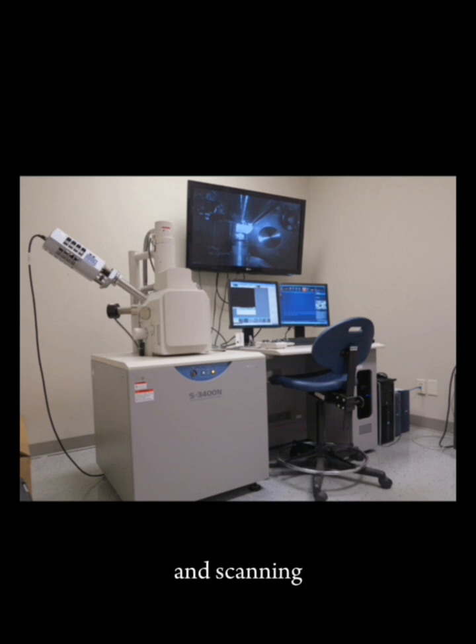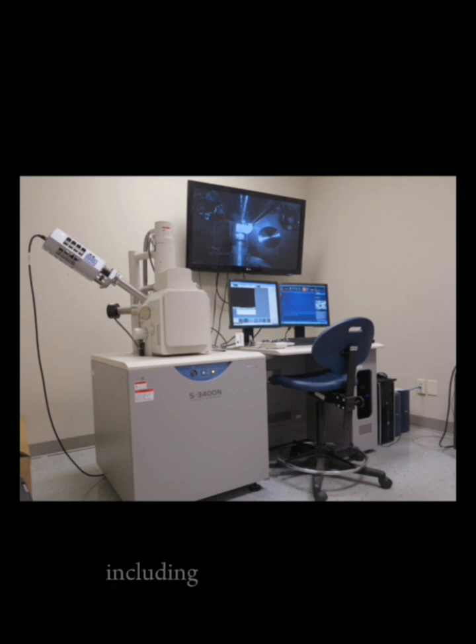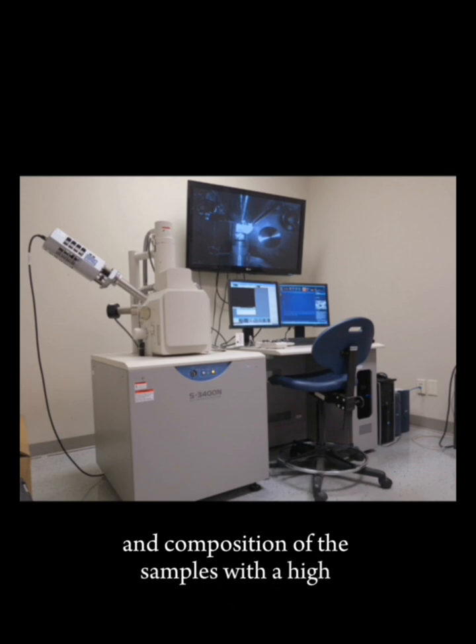Scanning electron microscope is a type of electron microscope that produces the image of a sample by scanning it with a focused beam of electrons. Scanning electron microscopes are widely used in various fields including material science, biology, and nanotechnology, and also used to observe the surface topography and composition of the sample with a high resolution.